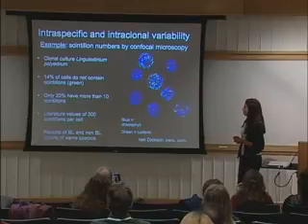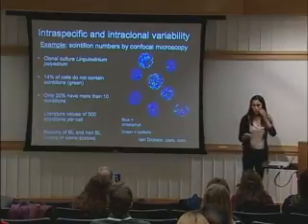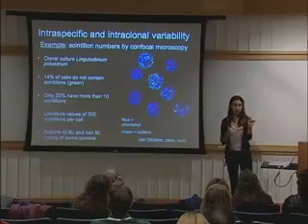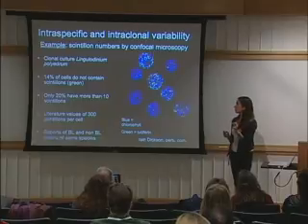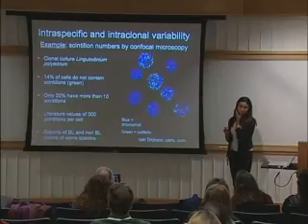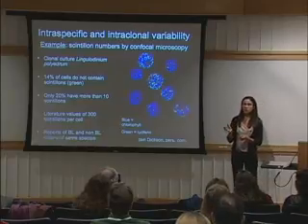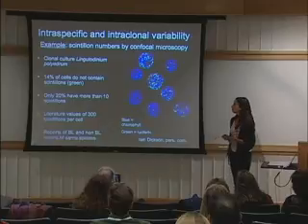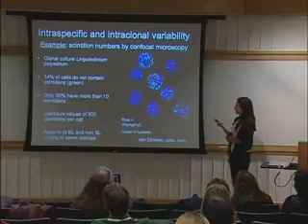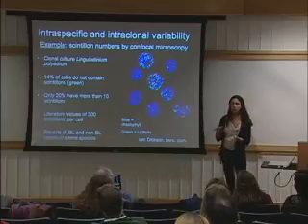I also wanted to show you another example, and this is from my lab. I have a program on bioluminescence, and we are working with these bioluminescent dinoflagellates that produce scintillons, which are these organelles that harbor luciferin and luciferase. So when you change the pH of the medium, or when you introduce any physical disturbance, when you shake the cells, you get the production of light. Luciferin turns into oxyluciferin, and there is light production accompanying the reaction. The green spots that you can see here, I think the blue is chlorophyll and the green is the luciferin, and this is what we can see with confocal microscopy.